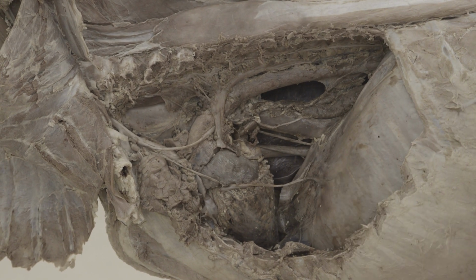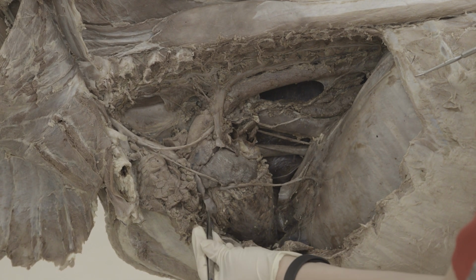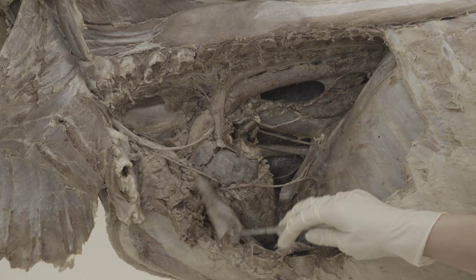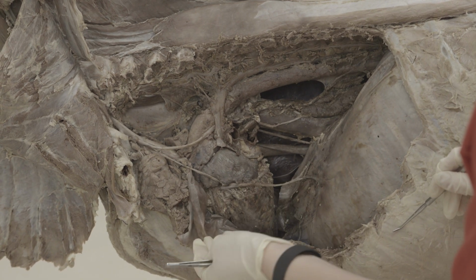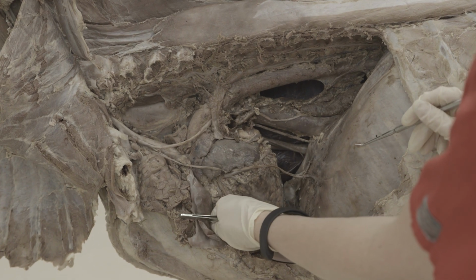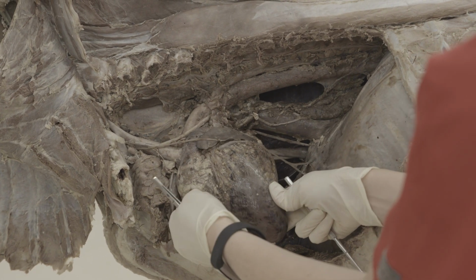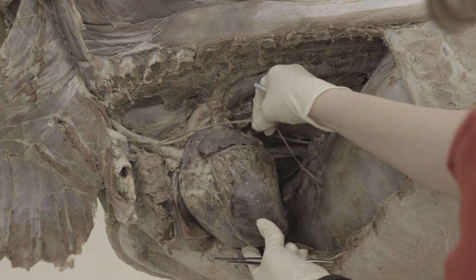So we'll look at the heart next. You have the pericardial sac. I've removed a lot of mine, but there's some there. You'll have to cut through that and reflect it and get the heart out of the pericardial sac to see the structures. And again, on the heart for the calf, we don't have injection, so it'll be a little more difficult to dissect. You also have to be careful because you will tend to have a lot of fluid in the chest, so just be aware of that and be careful.